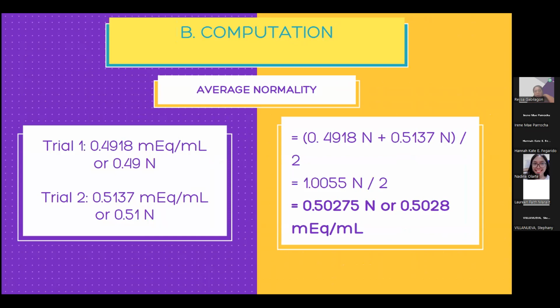This is what we made, hydrochloric acid, it's a dilute hydrochloric acid. Because coming from the concentrated solution, remember, we just got a concentrated hydrochloric solution from the fume hood, the one that is still fuming, it's a concentrated one. And then we diluted it in water. So that's a diluted solution of hydrochloric acid.